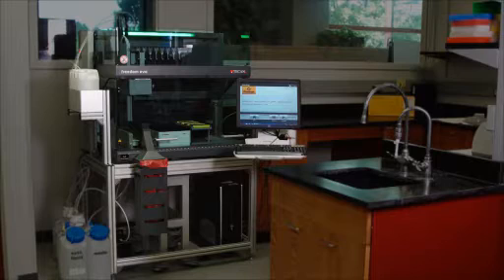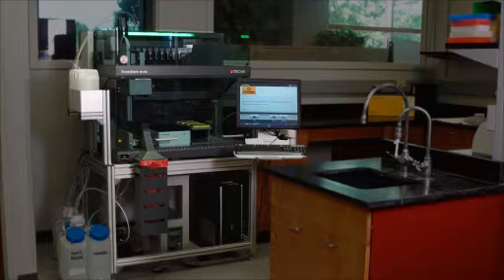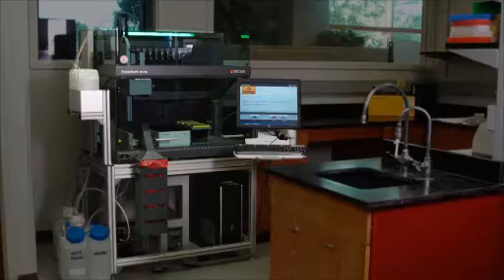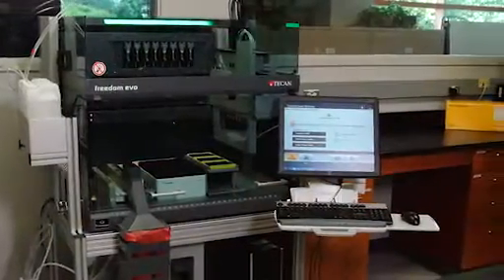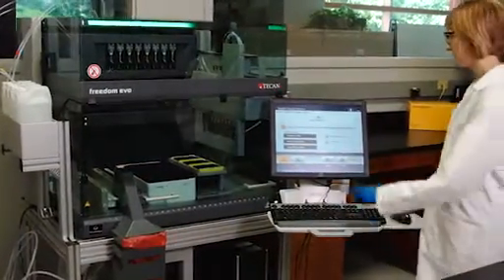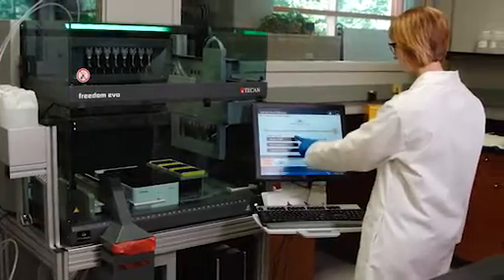Processing blood samples on the Tecan Freedom EVO HSM workstation using the Promega ReliaPrep large-volume GDNA isolation system provides unparalleled convenience and scalability, along with the quality and efficiency required by high-throughput genomics labs.